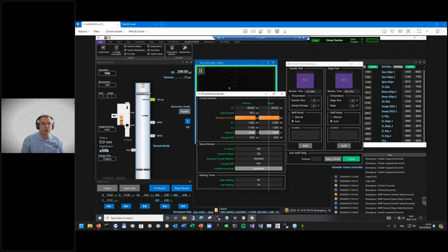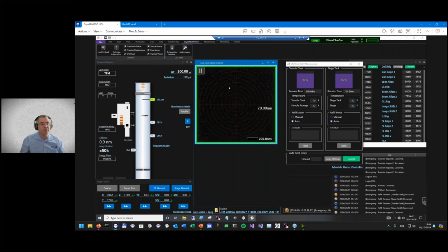In this case, this is a CryoArm, so this microscope is equipped with an autoloader, which also means that the facility manager can load up to 12 samples on Monday and then stay at home for the rest of the week working remotely with the machine, because the liquid nitrogen refill is managed automatically. There is no reason to be in the lab. You can equally stay at home.